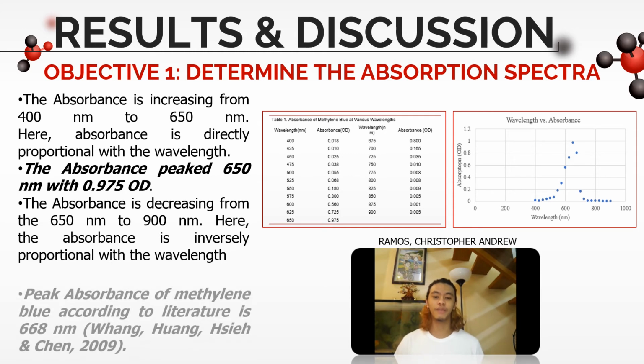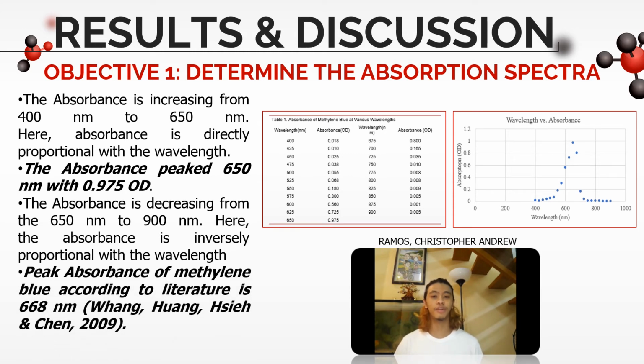Comparing the experimental peak wavelength of 650 nanometers to the literature peak of 668 nanometers according to Huang, Xie, and Chen, there is a 2.69% error, which implies that the experimental value is fairly close to the literature or actual value.